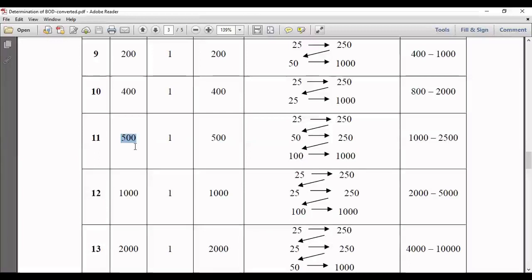That can be achieved by putting 2 ml directly in an empty 1000 ml cylinder, and then filling 998 ml directly with distilled water, right? So if I have to do single dilution, I require only 2 ml of sample in a 1000 ml measuring cylinder, and measurement of 2 ml is not a precise measurement, right?